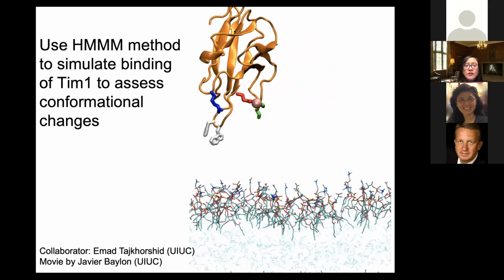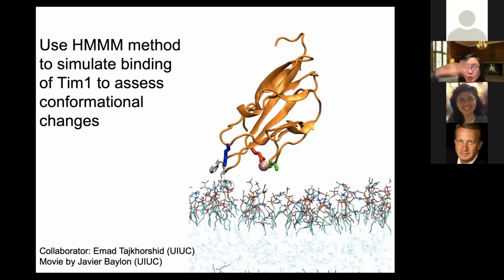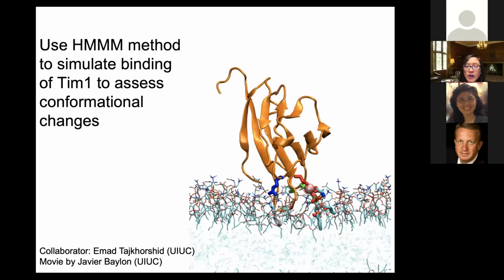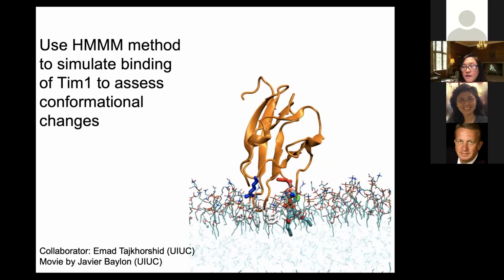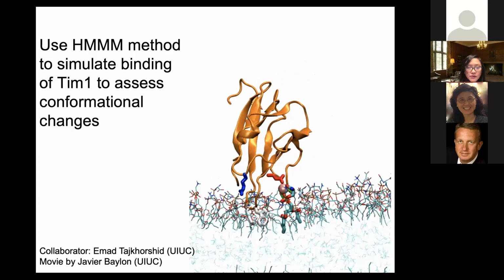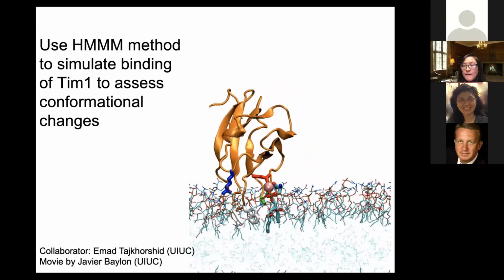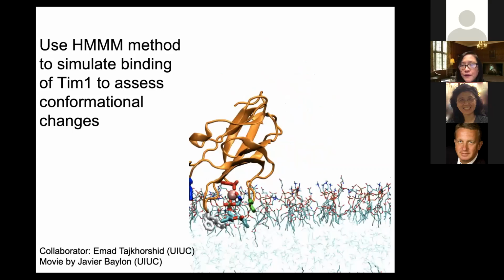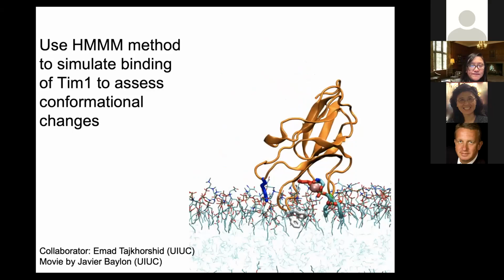The simulation with the protein in the water superphase, in this case, looking at its docking onto the surface and recovering an orientation very similar to the X-ray orientation that we obtained through the averaged X-ray reflectivity measurements.